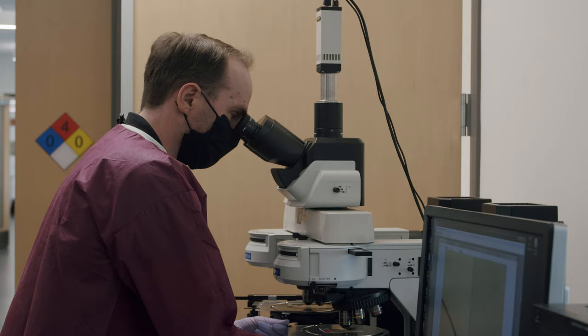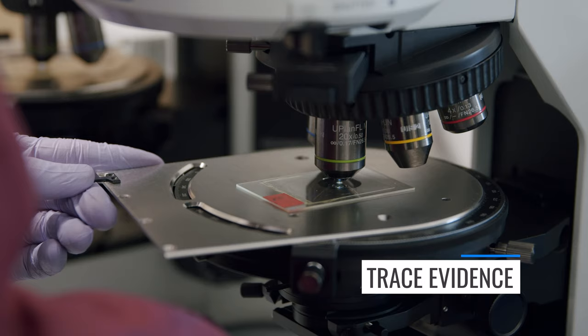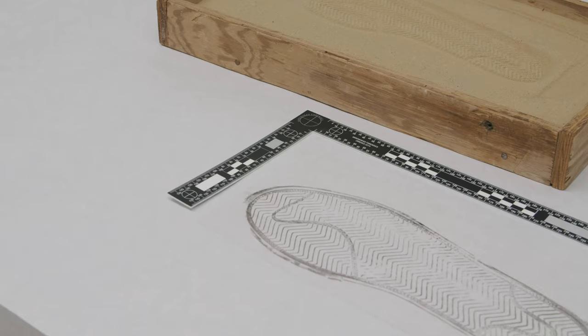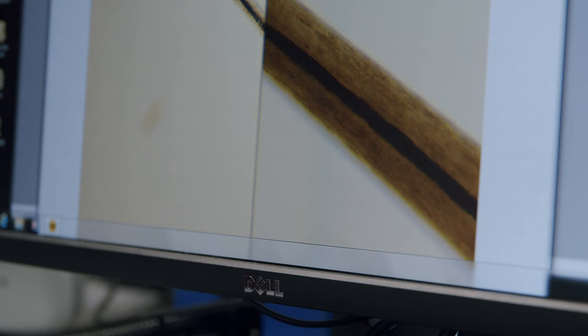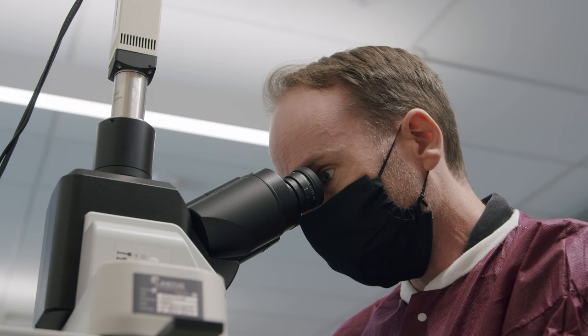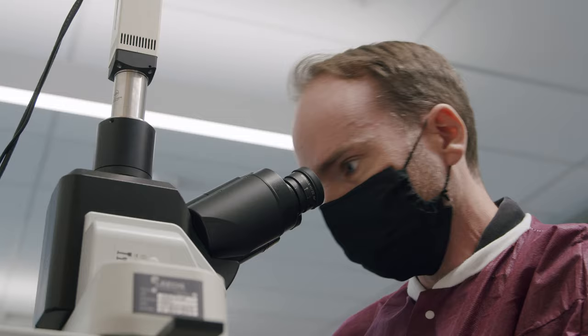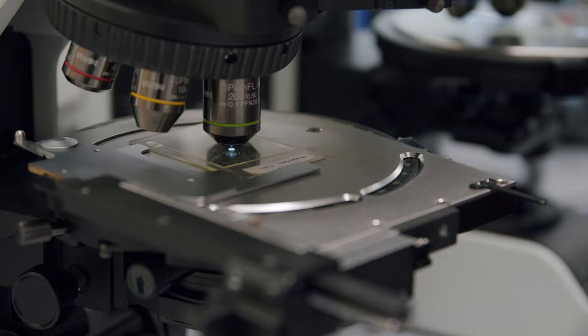Hello, my name is Chris Vance. I'm a criminalist at the San Diego Sheriff's Regional Crime Laboratory. Basically, trace evidence is any little thing that can be left behind at the crime scene that's not DNA or biology. It could be fire debris left at an arson scene. It can be shoe impressions left at a crime scene. It could be hair, paint, fibers from clothing. All those different types of materials we can analyze in trace evidence to see if we can either associate a person, place, or thing to a crime scene, or if we can identify chemically what something is.